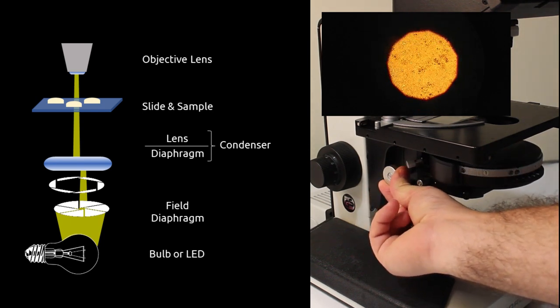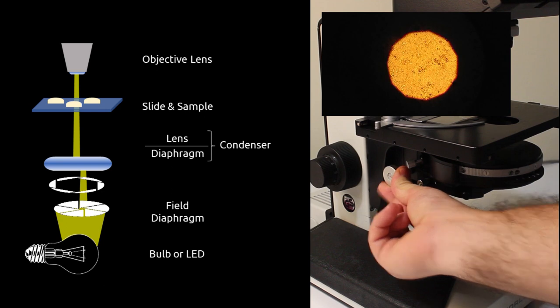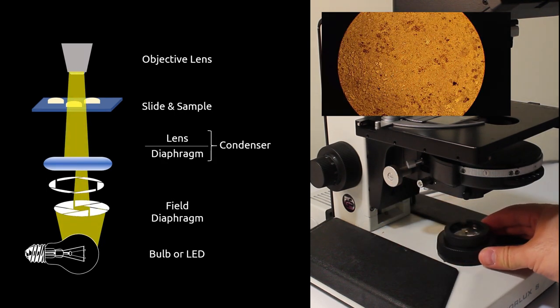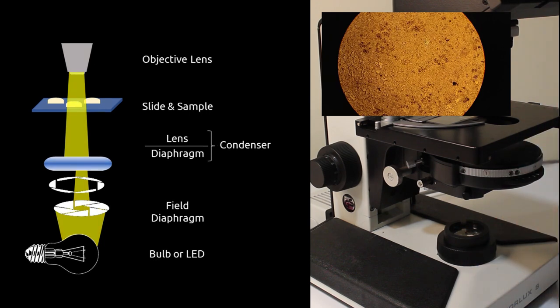If you need to, tweak the focus of your condenser as you're moving the hexagon in order to ensure that everything stays aligned. You then want to open up the field diaphragm until the edge of the hexagon disappears from the field of view. You don't want to open it beyond this point because that can reduce your contrast.